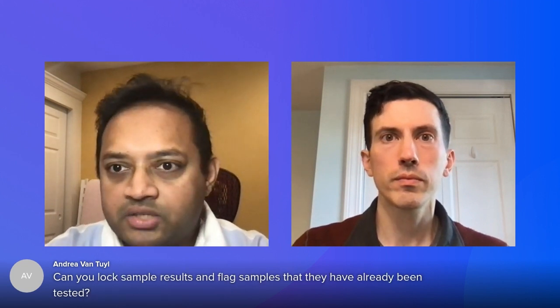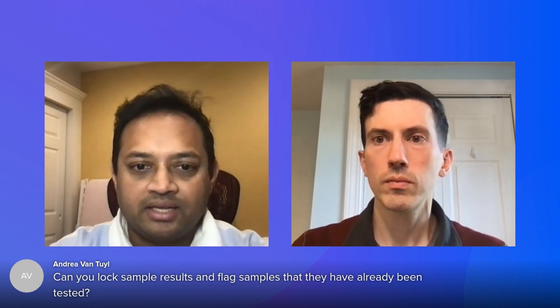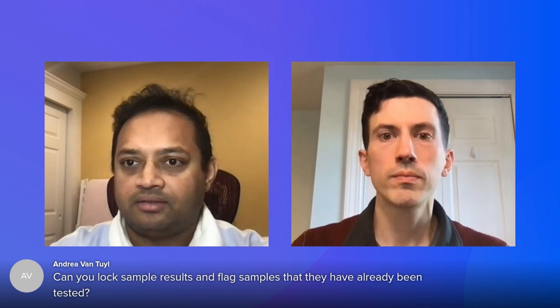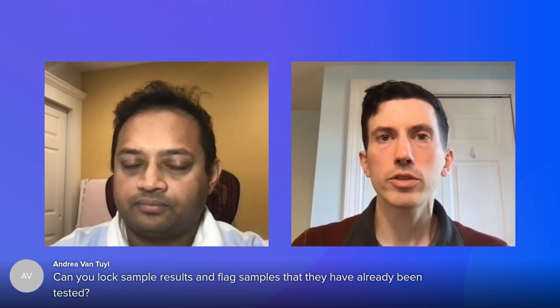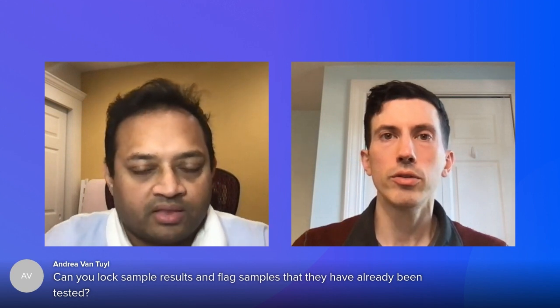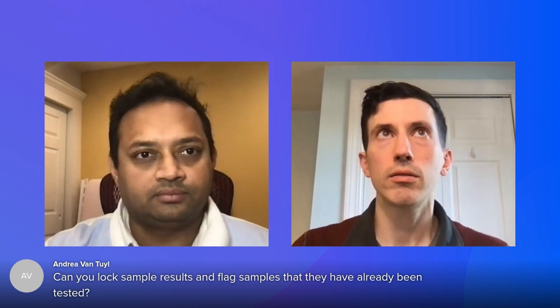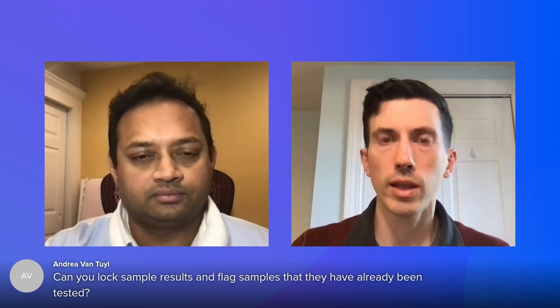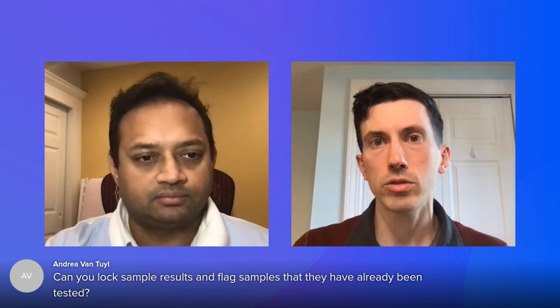The next question we have is, can you lock sample results and flag samples that have been tested? Tom, you want to take this? Yeah, you certainly can, through the use of looking up key attributes and creating conditional statements within the data capture to pass or fail things based on those QC parameters.